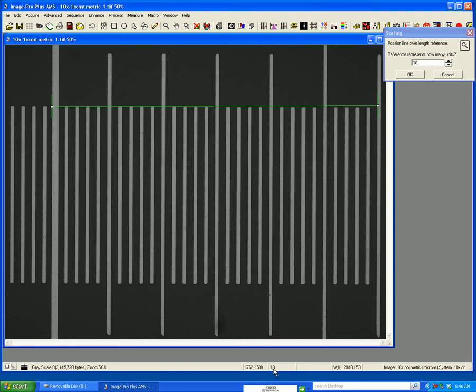If you'll notice down here, this shows you the grayscale. This is a grayscale image 8-bit, which is how you should capture these. If I go to the black, it's towards zero.